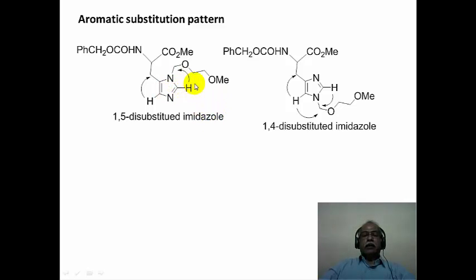And when you irradiate this particular hydrogen, there is a nuclear Overhauser enhancement of the CH2, which is flanked by nitrogen and oxygen. This would be probably the highest chemical shift value of hydrogens in the aliphatic region. So this enhancement can be very clearly seen. And when this hydrogen is irradiated, the enhancement of the signal corresponding to this CH2 can be very easily observed. On the other hand, if you do the two position hydrogen irradiation in this molecule, that results in the enhancement of this particular signal, whereas when you irradiate the other hydrogen, that has an enhancement of both this methylene as well as this methylene, because both the methylenes are adjacent positions with respect to this particular hydrogen.